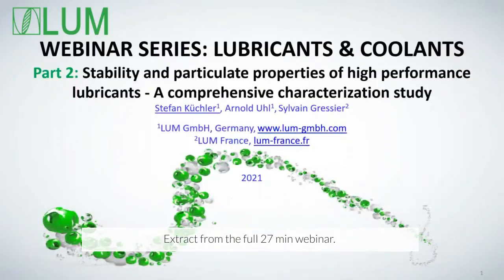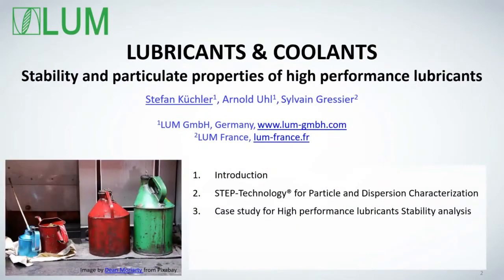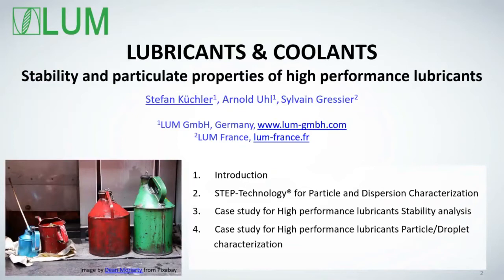Hello everybody. The topic of our today's session is stability and particulate properties of high performance lubricants, a comprehensive characterization study. My name is Stefan Küchler. In the main part, we will present two case studies. First about stability analysis, second about particle droplet size characterization of high performance lubricants.